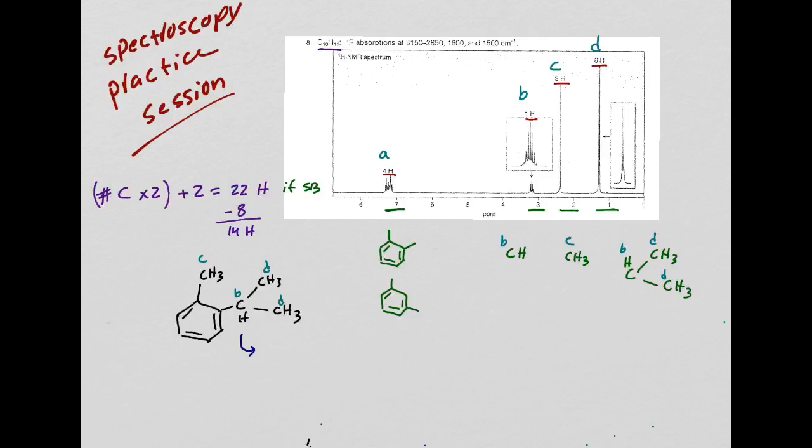So let's go over this one more time. From this carbon, it has no hydrogen. From the other side of the neighboring, it has 2 CH3s. These two are equivalent to each other. Because these two are equivalent to each other, they're going to be additive. So the N+1 rule here, it would be 6 plus 1, which is 7. So I expect a heptet over here.